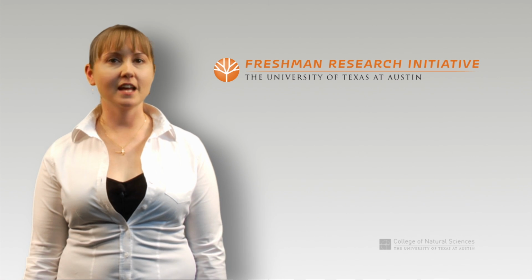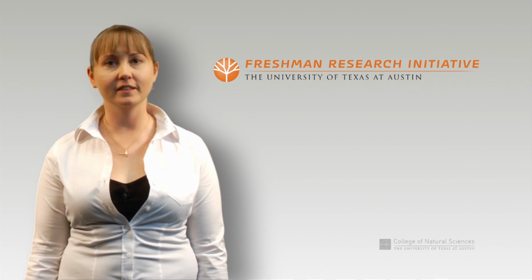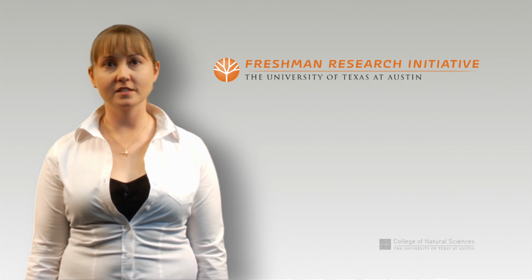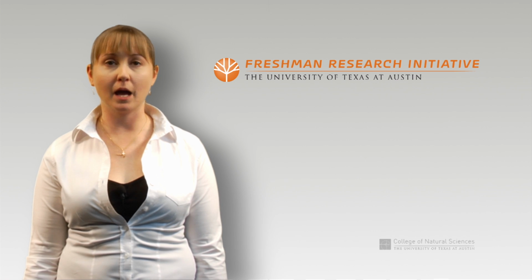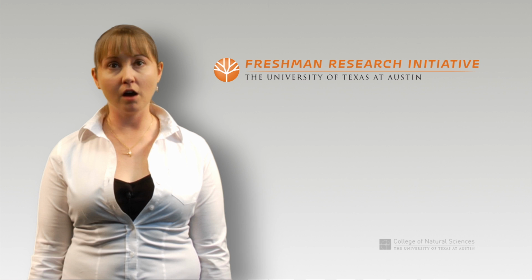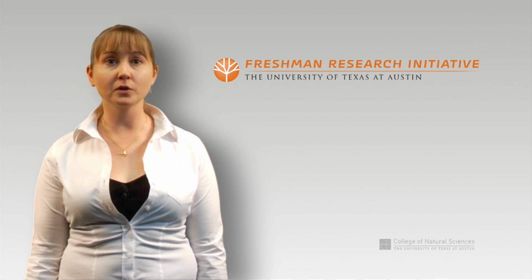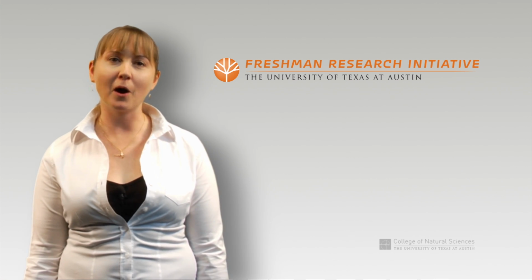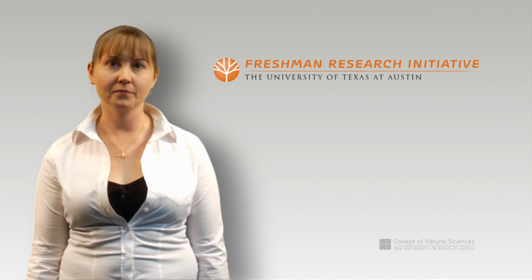I'm sure you've heard time and time again how important laboratory safety is. In this video, we will discuss some of the most critical aspects of laboratory safety. This video is not meant to comprehensively cover all aspects of lab safety, but to familiarize you with the laboratory environment and provide you with the tools to build some common sense about working in a laboratory.